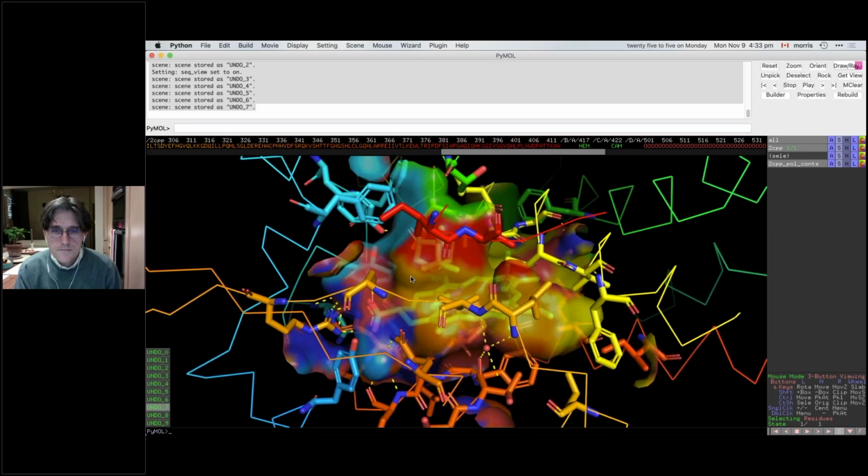Another quick question for you. Is it possible to view the commands associated with actions, like when you select a preset, for example? That's a good question. Without inspecting the source code, I don't think it's necessarily very obvious. So it doesn't record menu clicks and things like this then? It doesn't record the sequence of operations that you're performing.